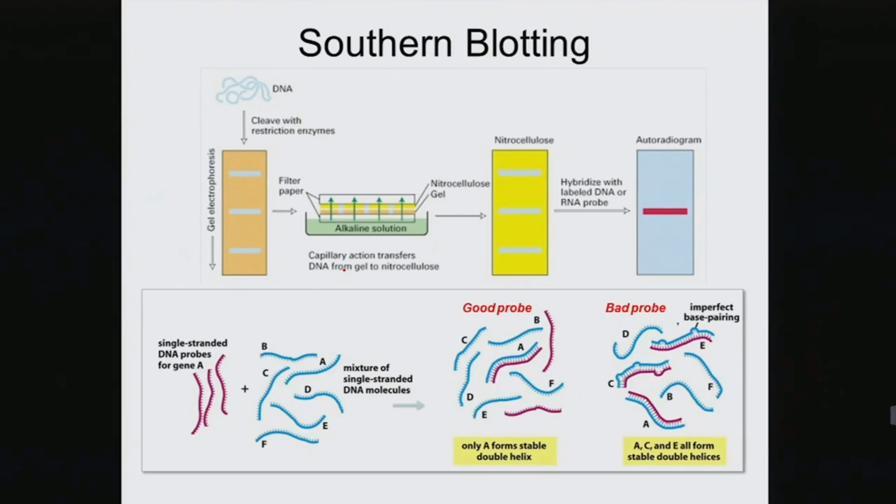So you can design these probes, again, being single-stranded, attach a radioactive label to it, so maybe P32, that could emit something that can be picked up on a film, so you can get an autoradiogram, mix it overnight with your nitrocellulose membranes. If there's complementarity to a specific sequence in your DNA fragment, then you would get base pairing occurring, and you would be able to pick up that signal onto the film that you've incubated your nitrocellulose with.